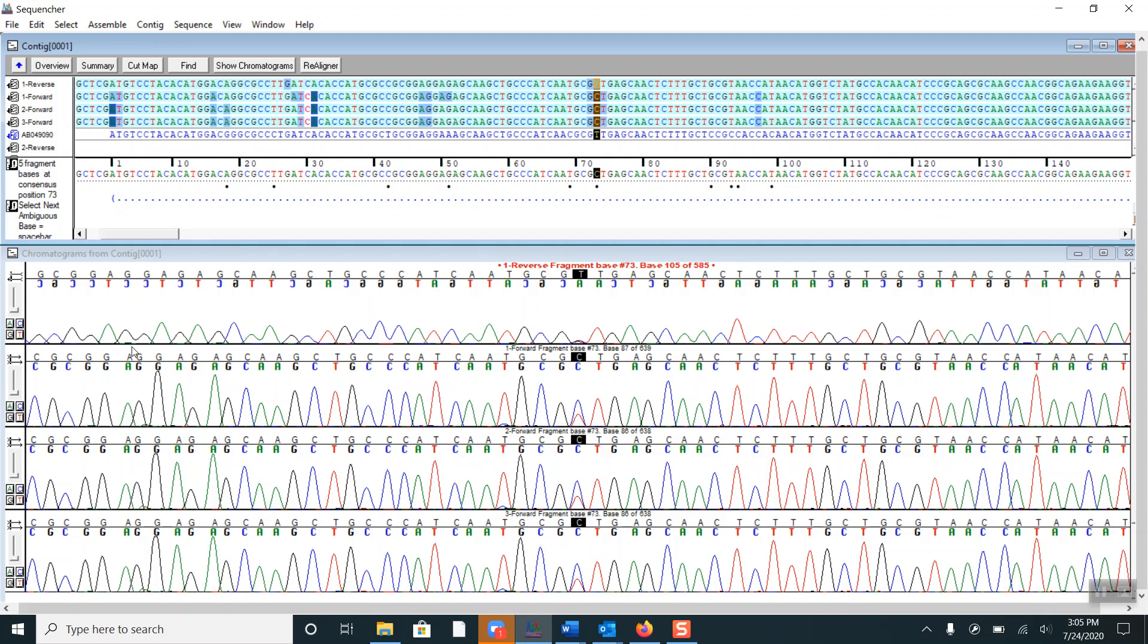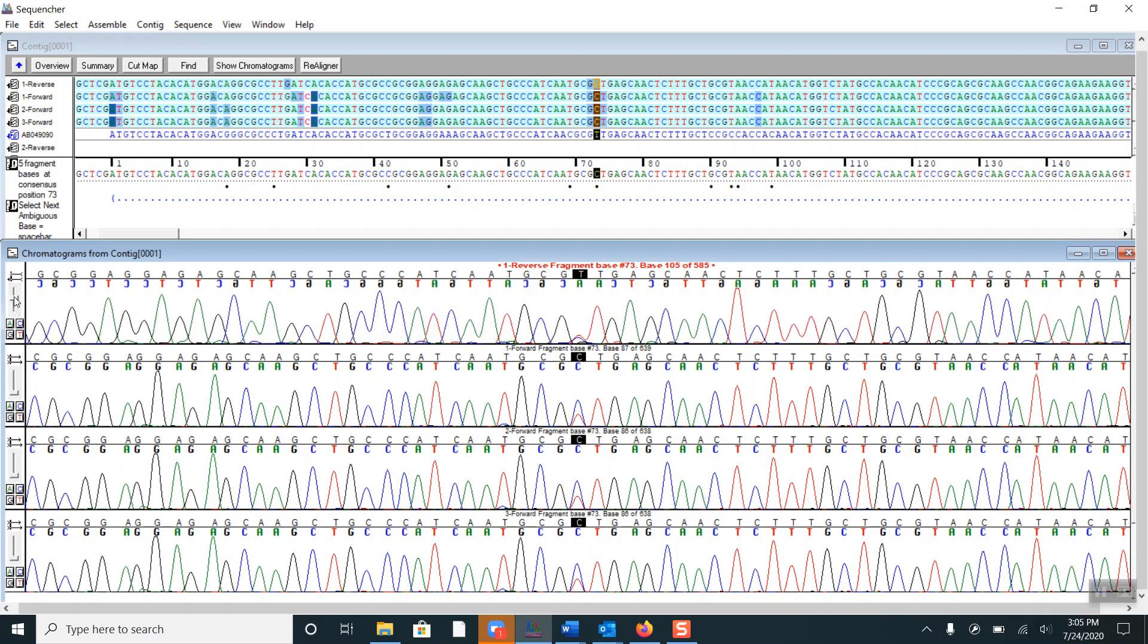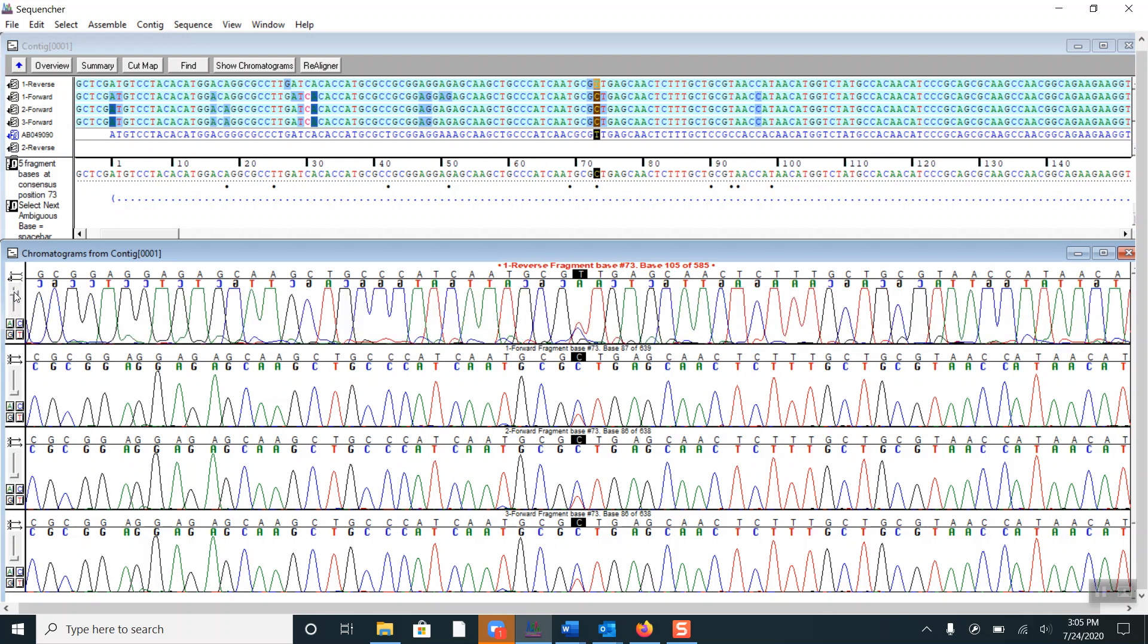If I adjust the view of this fourth fragment by increasing the size of the peak, we can see that it also has both a C and T peak.